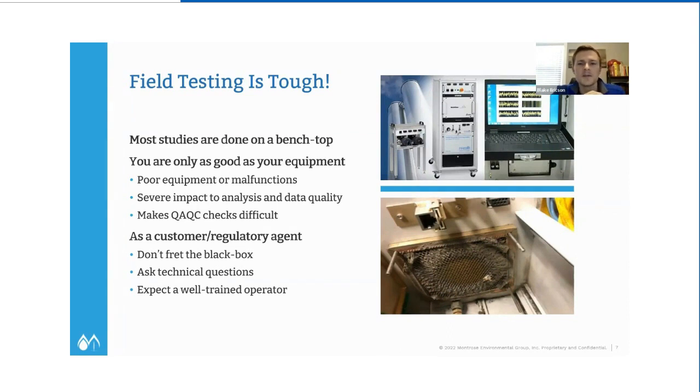Anytime you hear someone say, "Yeah, I'm dangerous with an FTIR," kind of wave that red flag and be like, well, are you dangerous to yourself, or are you dangerous as a whole? Because we're not looking for dangerous. We're looking for very well-trained, seasoned operators that run this thing and are very confident with what they're doing.